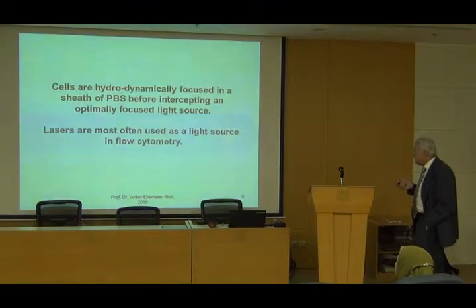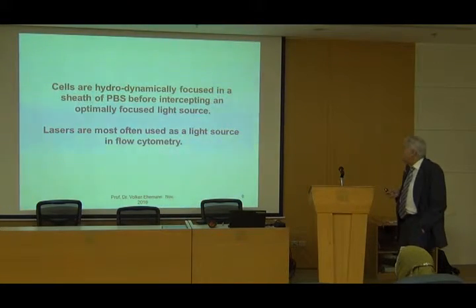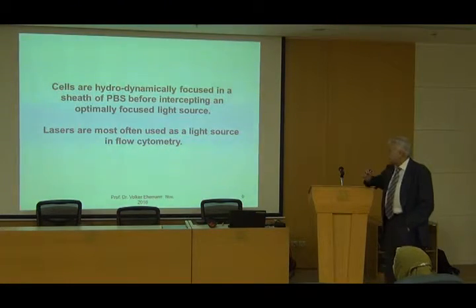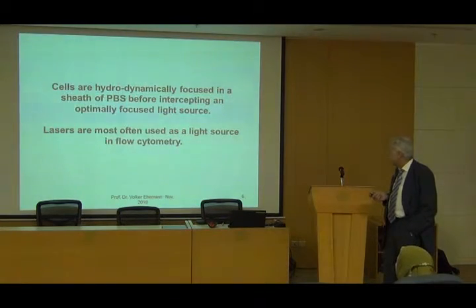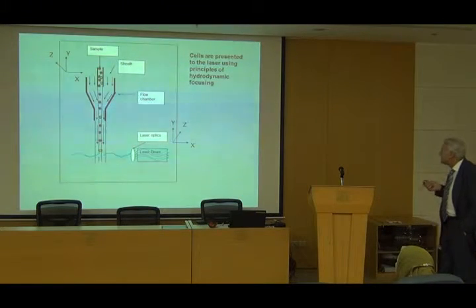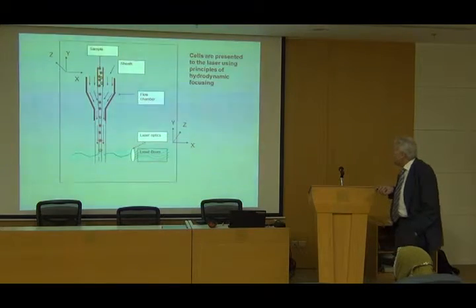Cells are hydrodynamically focused in a sheath of PBS before intercepting an optimally focused light source. The light sources are lasers or HBO 100 lamps. Cells are presented to a laser using the principles of hydrodynamic focusing. You see here the flow chamber.